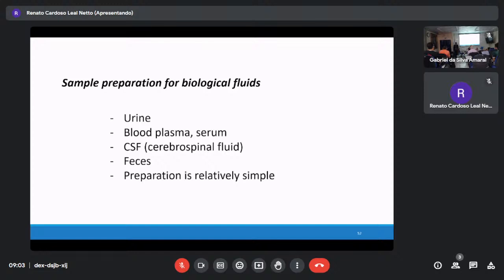Regardless of smell, what's the problem? Think about species. Nowadays, trans-species is very important. But you are a different species because of your gut microflora. The sample here is now urine. What's the state? Liquid, right?